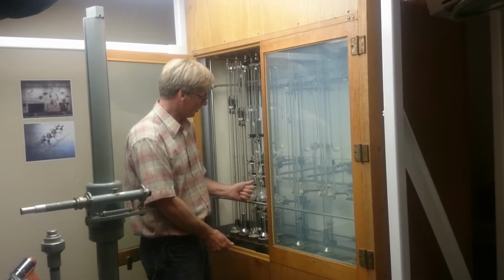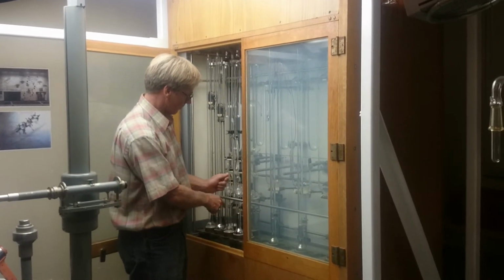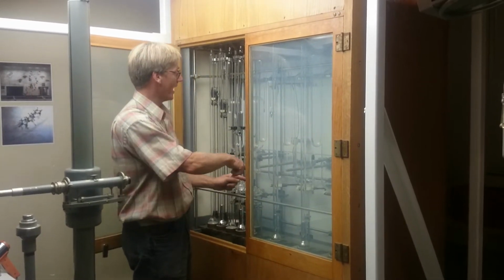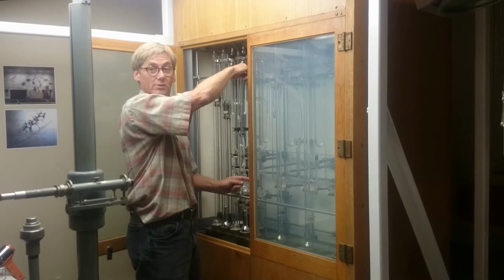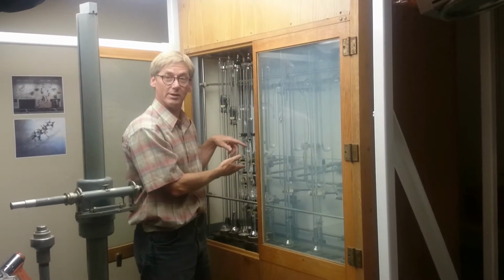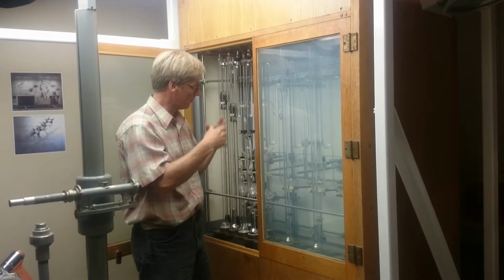Okay, so with that pushed up here, the same mercury, which is at a particular pressure at that height, will go all the way over to be the same pressure here, but then you have a vacuum on this side, the mercury would rise up to a vacuum. The difference in column height gave you the pressure over here as well. So again, you're measuring pressure, volume, temperature on the small sample. Then you pump it away.